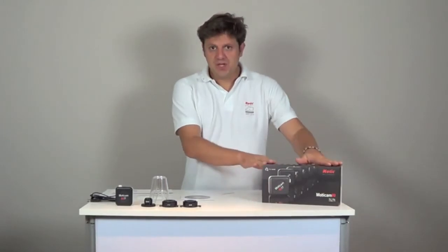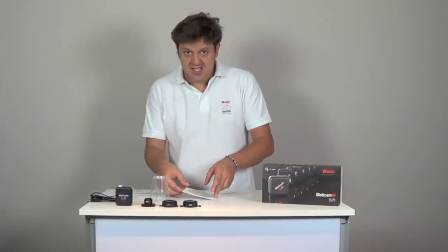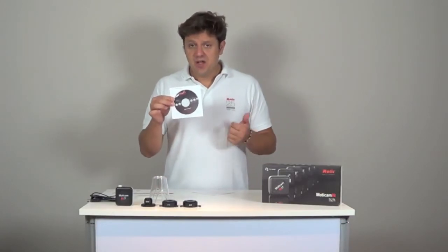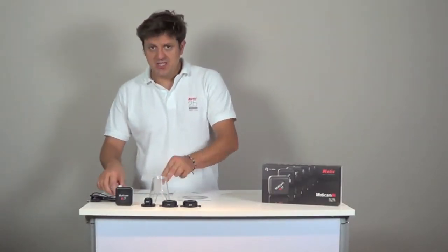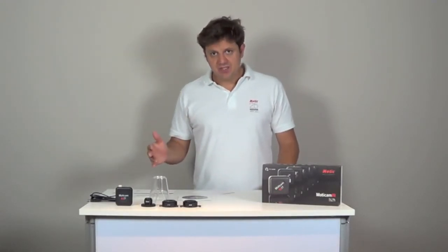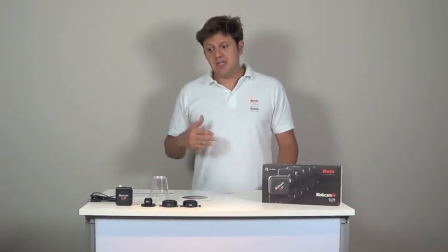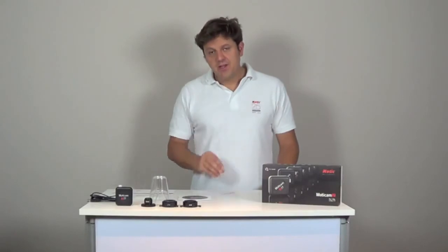All Moticam CMOS cameras come in one box with the tools you might need to mount your Moticam onto the microscope. You will find a quick start guide, a CD with the software Motic Images Plus 2.0 compatible with Windows and Mac, and two calibration slides — one in glass, one in plastic — to calibrate the software. Video tutorials on our website give detailed information about the software and calibration procedure. Moticam is also compatible with other software using universal drivers called Twain and DirectShow, and there is an SDK program that allows you to program your Moticam yourself.